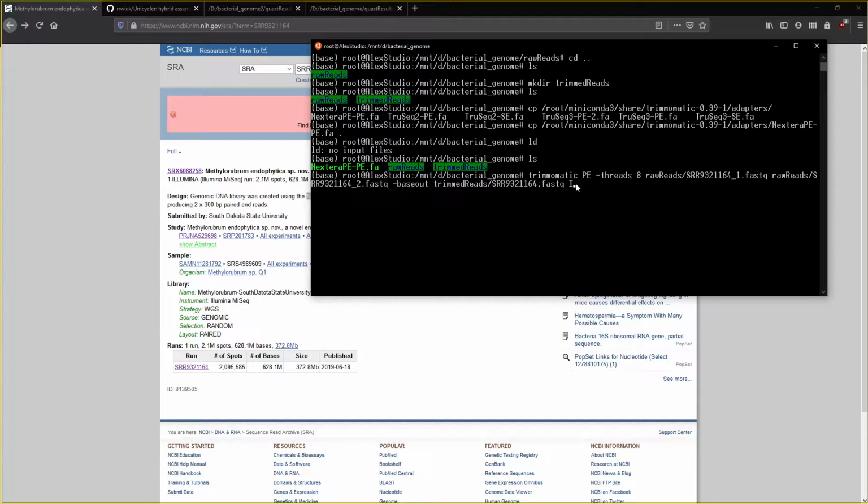All right, so now Illumina clip, we're going to remove our adapters, Nextera, and then 2, 30, 10, and then instead of 2, like we did with the RNA sequencing, going to do 8. So that's a match length of 8, I believe. And then we'll keep both reads.